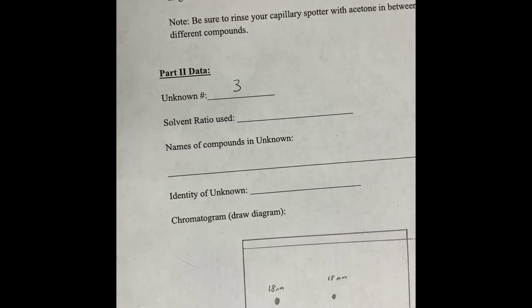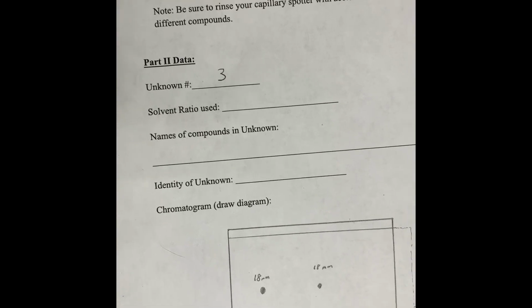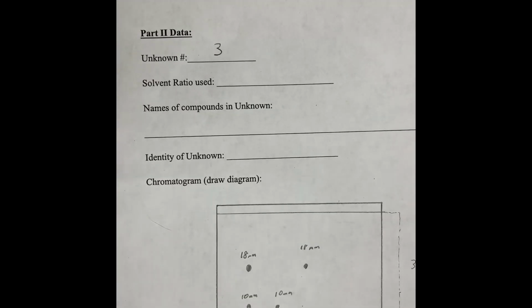So your task is to determine the identity of the unknown. It would be one of the 3 drugs that I just showed you.